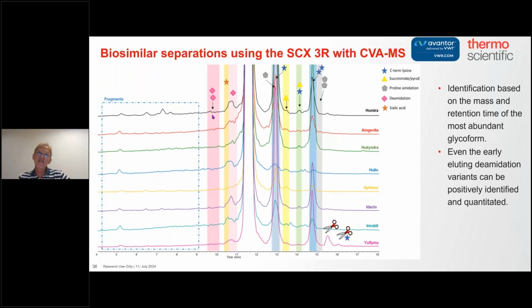And you can say, can you tell the difference with 1 Dalton on a 150,000 Dalton protein? Yes, we can, because they're coming out separately from the main peaks. You've separated them. But even if you didn't, if it wasn't perfect, you could still run it because we know where that comes out. So you can use retention time for identification as well. So yes, this can be done.